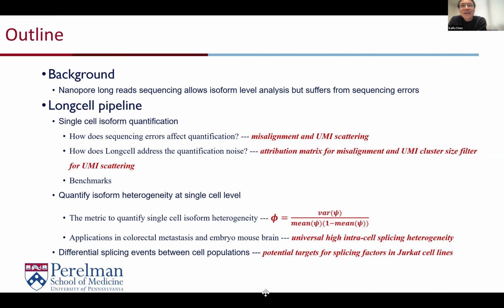But I think what's cool is your algorithm can directly analyze the intracell heterogeneity versus the intercell heterogeneity. And what's very interesting is different genes show different heterogeneity. Some genes show almost always one-versus-one heterogeneity in all the cells, while some other exons or other splicing sites tend to be either 0 or 1 for the heterogeneity value, which means there is no intracell heterogeneity, but great intercell heterogeneity.